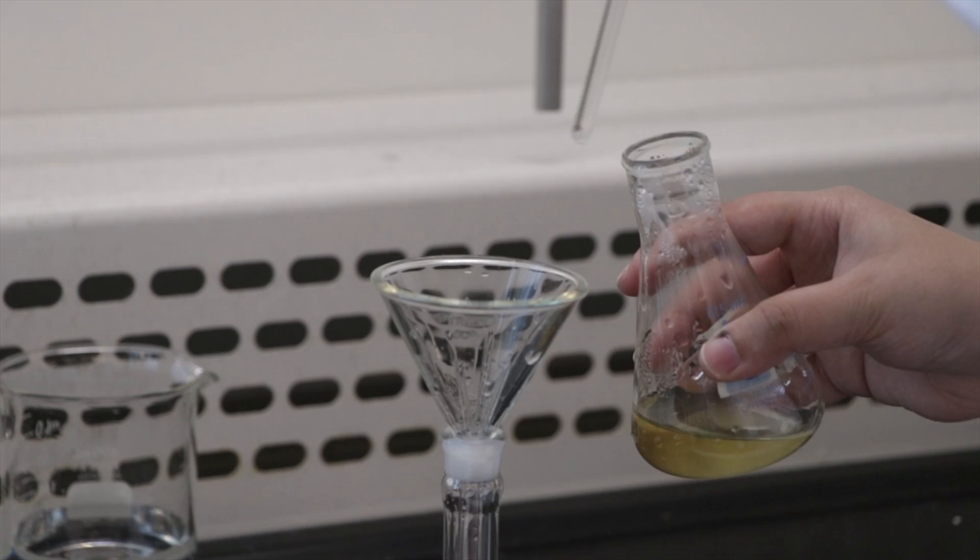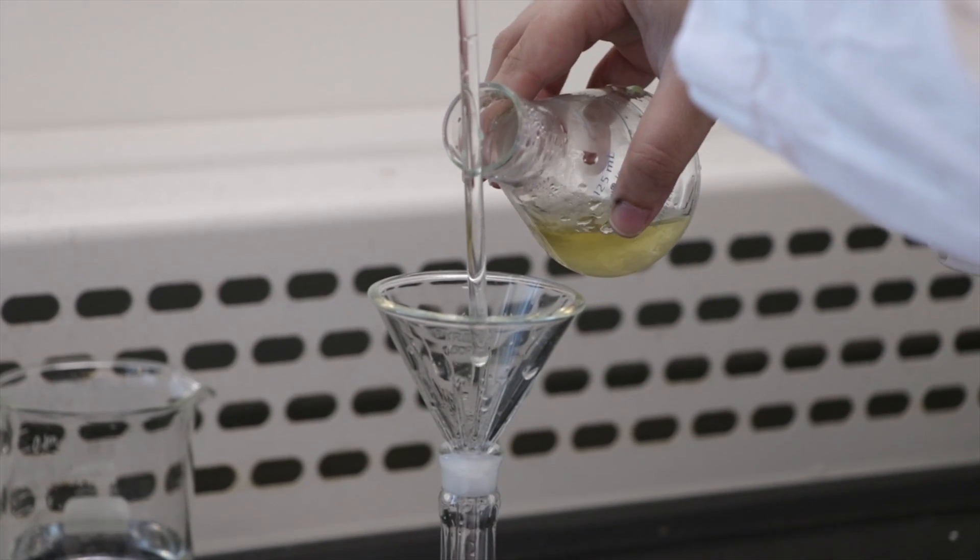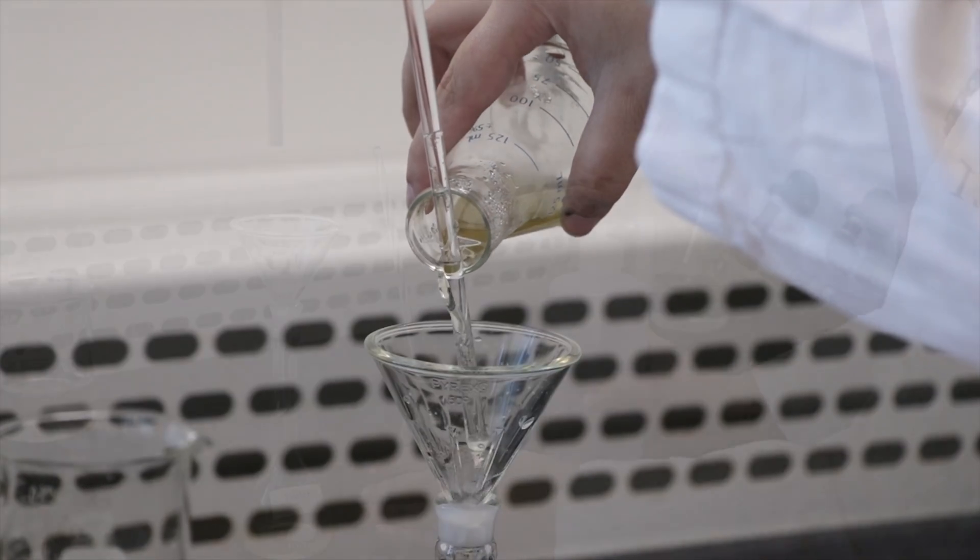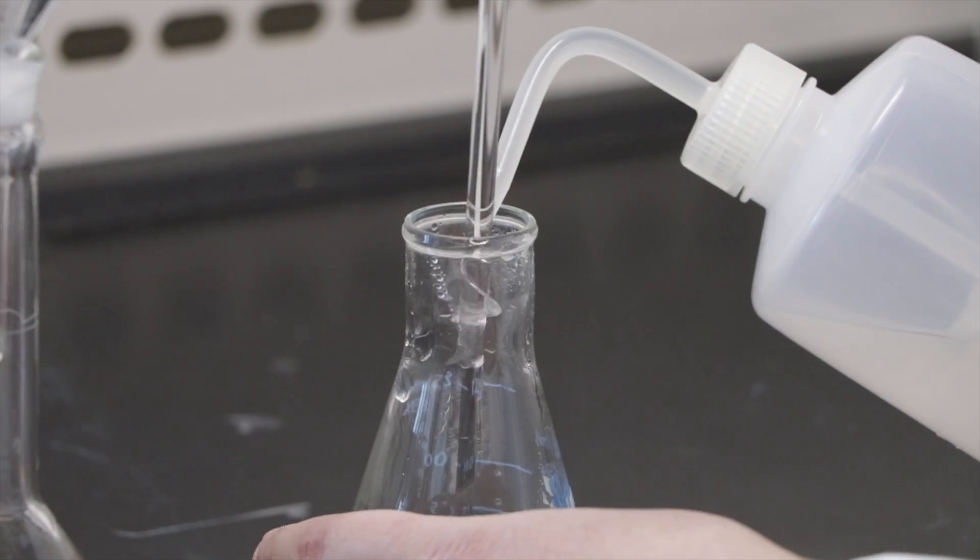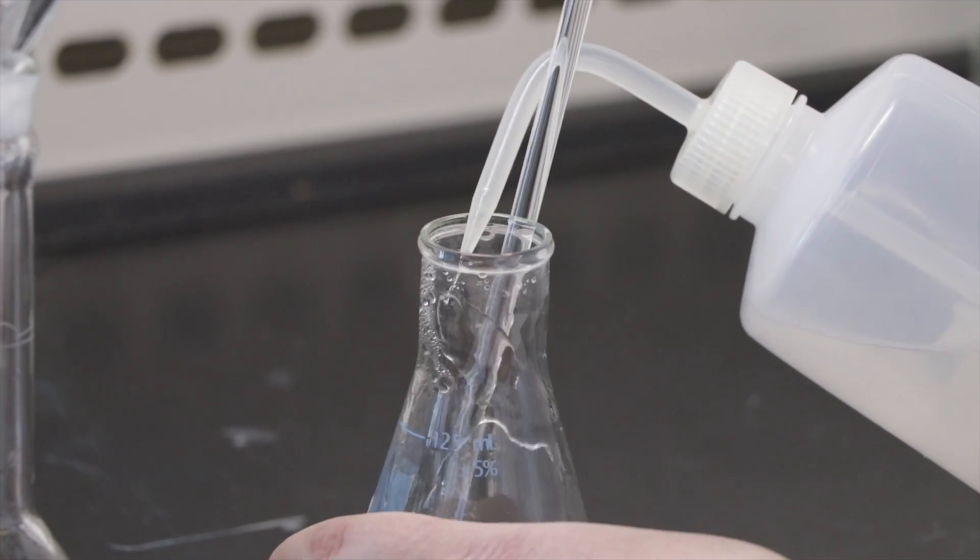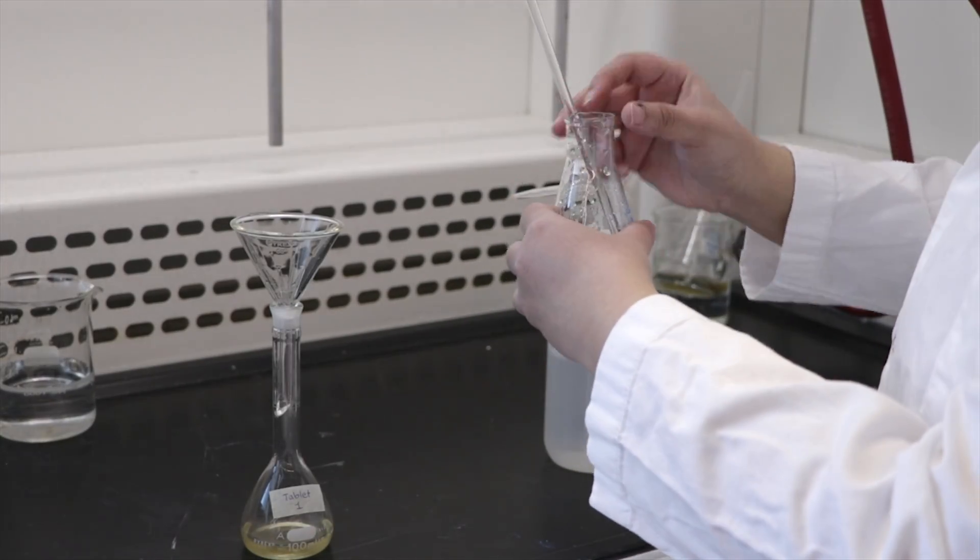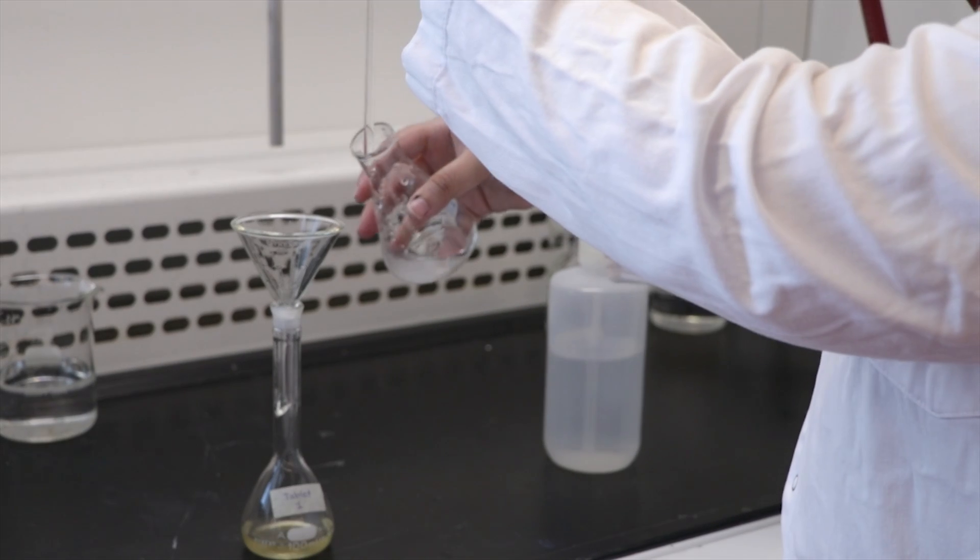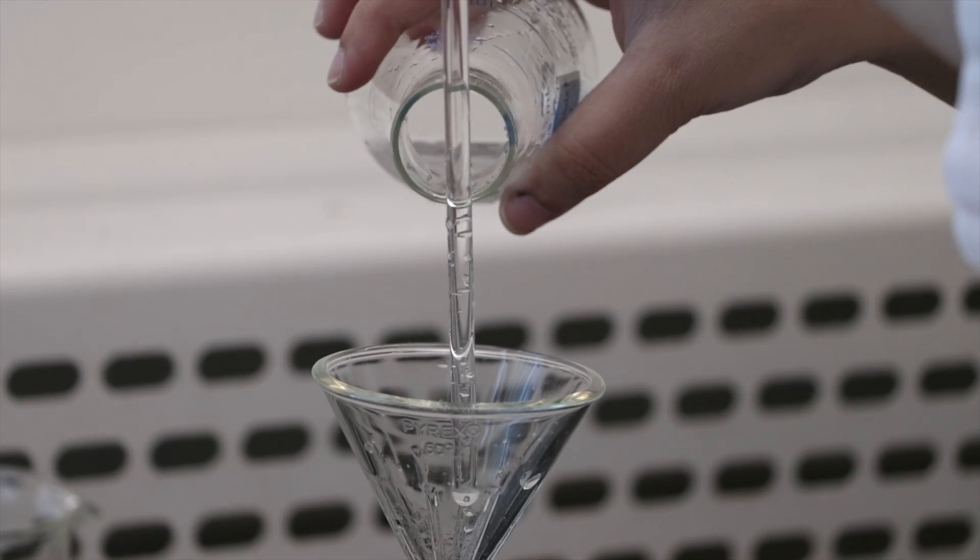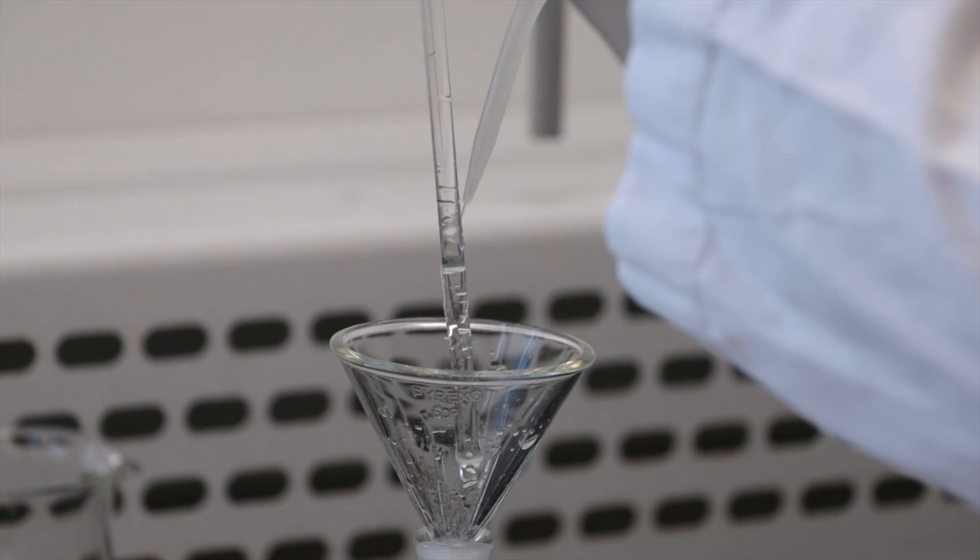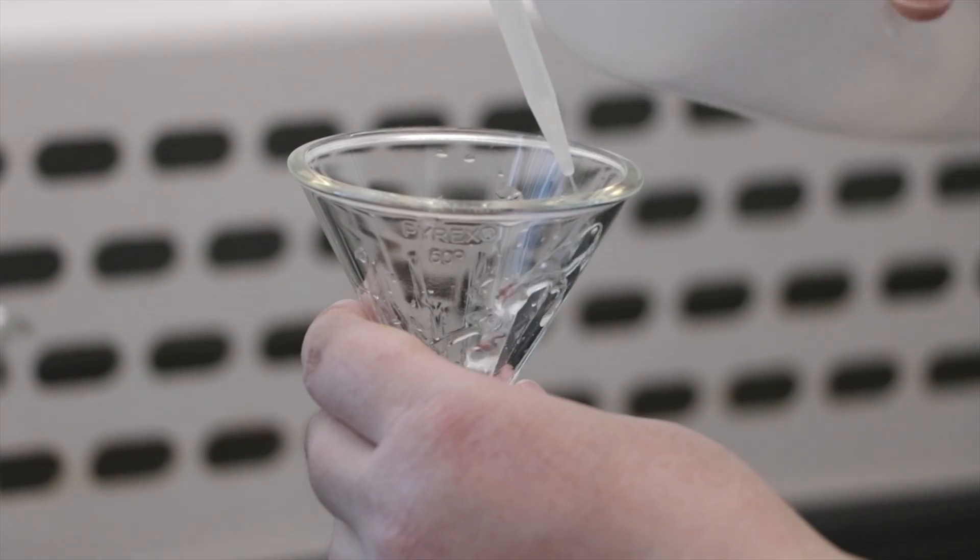Next, quantitatively transfer each solution into a labeled 100 ml volumetric flask. Thoroughly rinse the Erlenmeyer flask to transfer any remaining contents into the volumetric flask. Remember to rinse the glass rod and funnel as well to ensure complete transfer. Use a minimum amount of distilled water for this step as you do not want to go over the 100 ml mark.